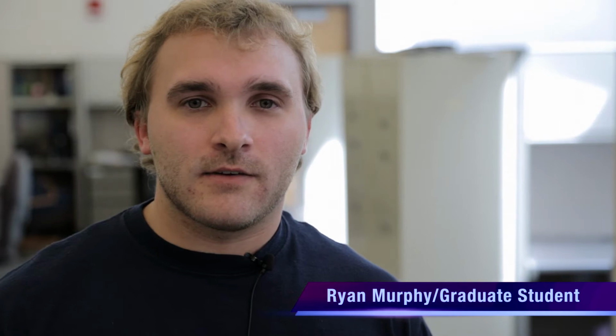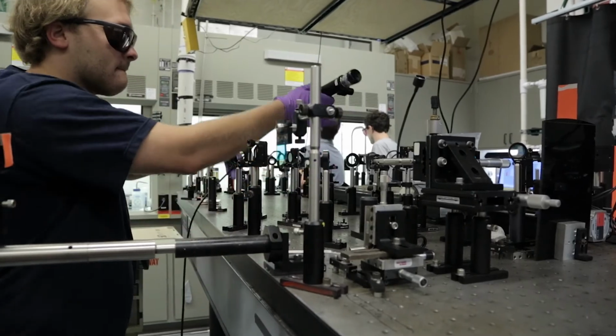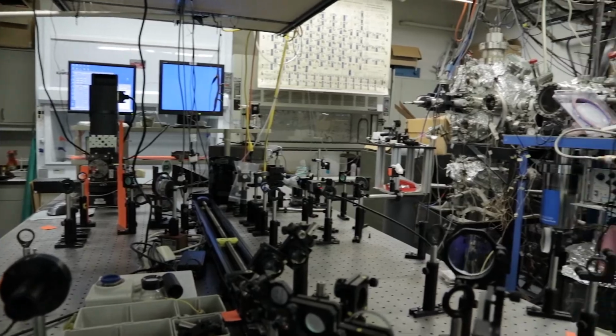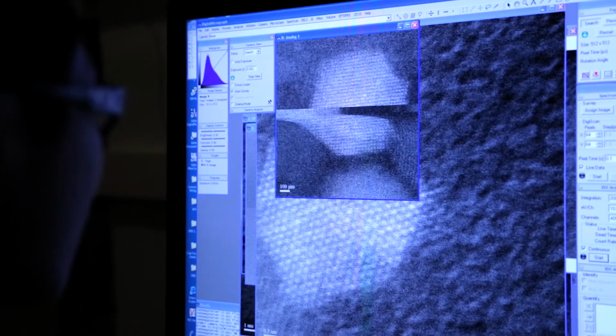And from that, we learned that we can make nanoparticles from irradiating thin films. So we melt the film, and it flies off of the substrate, hits another substrate, and it recrystallizes. And what we're trying to understand is, after we've seen this amazing control of the nanoparticle size, and we've even created new shapes of nanoparticles, how did they recrystallize?